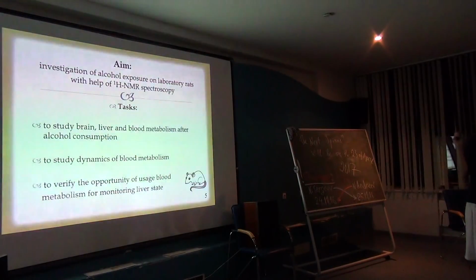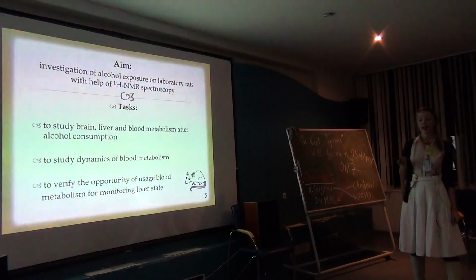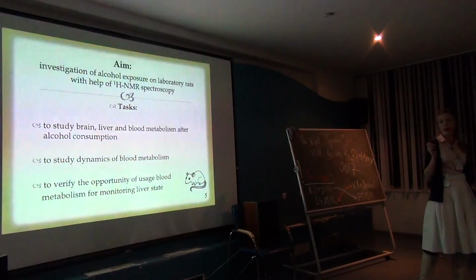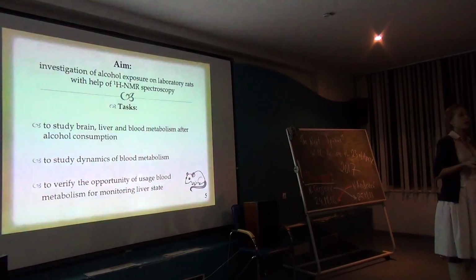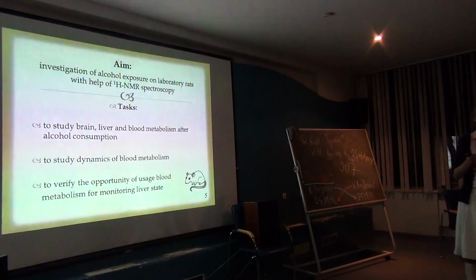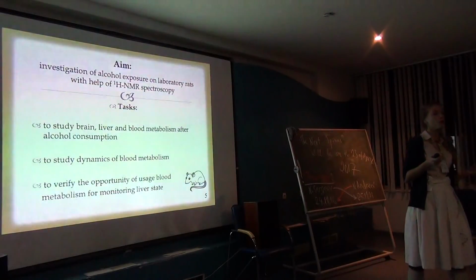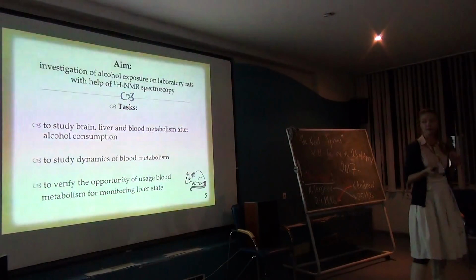The aim of my work is the investigation of alcohol exposure of laboratory rats with the help of 1H NMR spectroscopy. We solved the following tasks: to study brain, liver, and blood metabolism after alcohol impact, to study the dynamics of blood metabolism, and to verify the opportunity of using blood metabolism for monitoring the liver state.